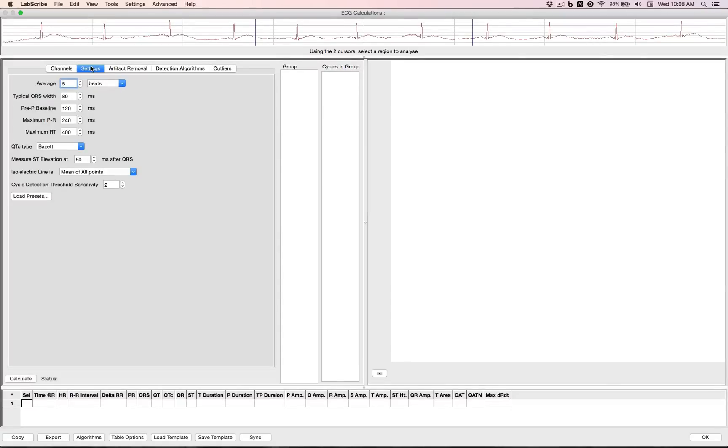Under the Settings tab, we can set specifics as far as detection, but we can also load a preset for the zebrafish. That sets everything for us automatically.